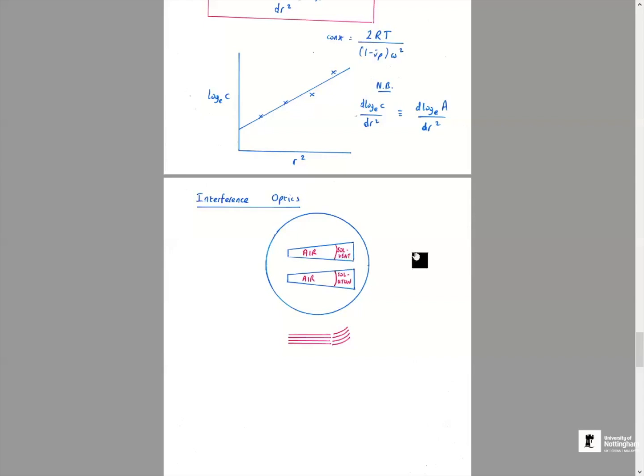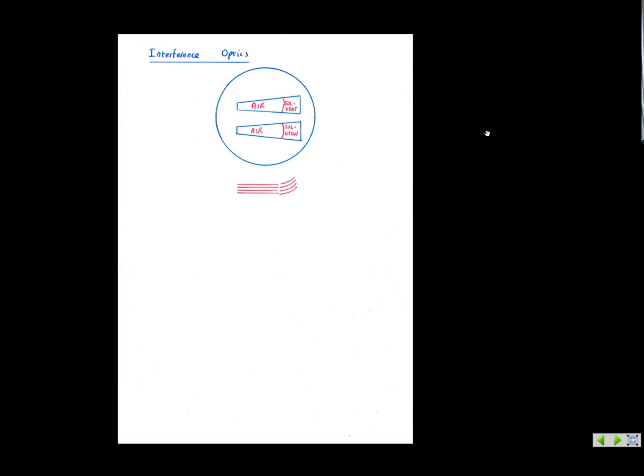So we just fill the reference cell and the solution cell with between 0.07 and 0.2 mL, depending on the optical path length of the ultracentrifuge cell. And by keeping the column short, you can get to equilibrium a lot faster. For small peptides and oligosaccharides, it could take a few hours.